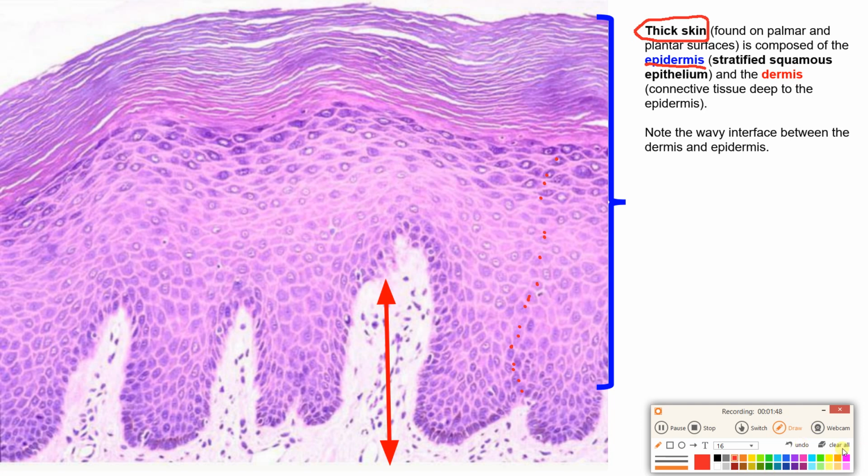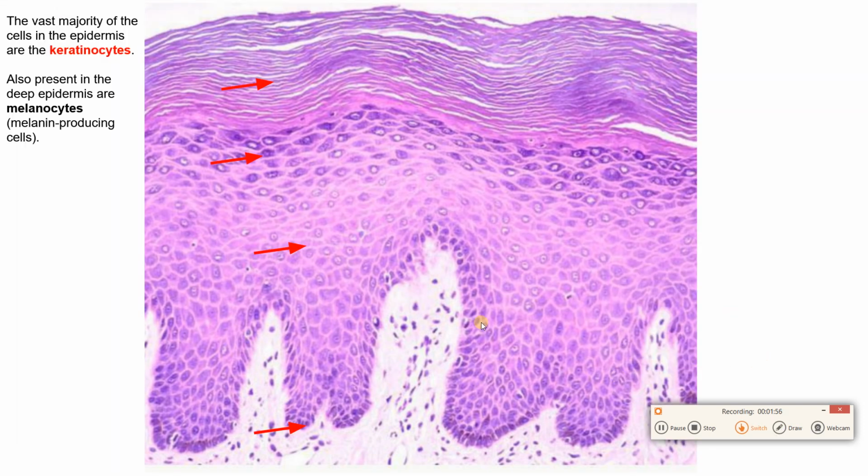Okay, let's get into a little more detail about this epidermis here. Most of the cells in here, whether they're kind of roundish and big with visible nuclei or kind of granular, or whether they've been squished flat and are dead, are these cells called keratinocytes, which contain keratin. In fact, these cells up here are dead. Keratin is this tough, waterproof, protective protein.